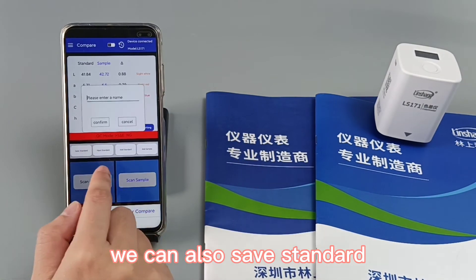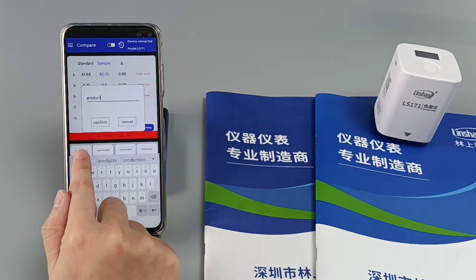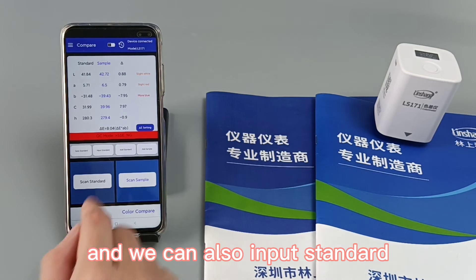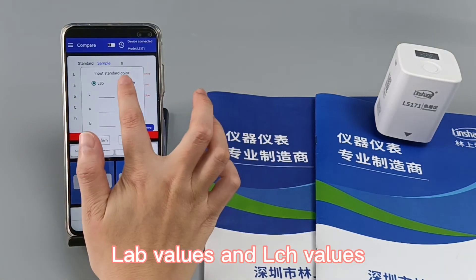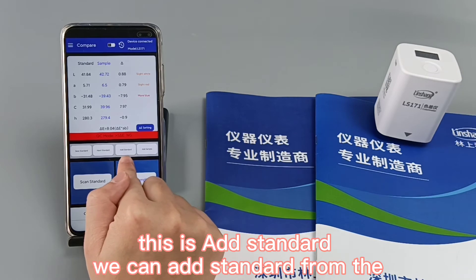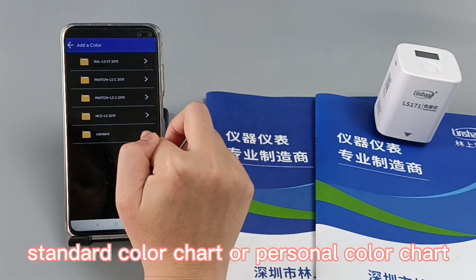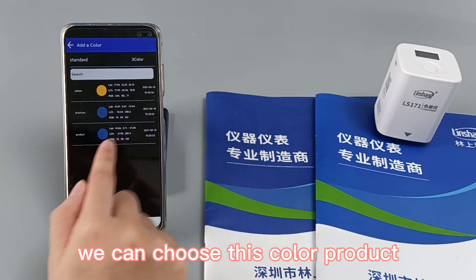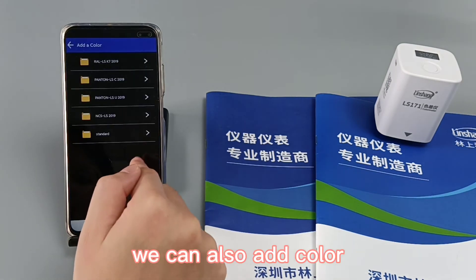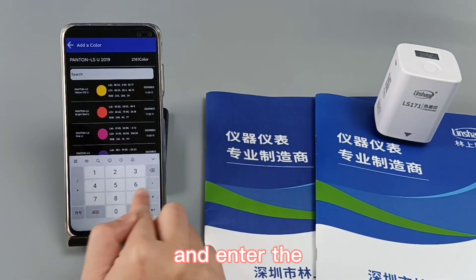We can also save the standard and confirm. We can also input standard LAB values and LCH values of the standard color. We can add standard from the standard color chart or personal color chart — for example, choosing a color product that was added previously — or add from the Pantone color chart by entering the color number.